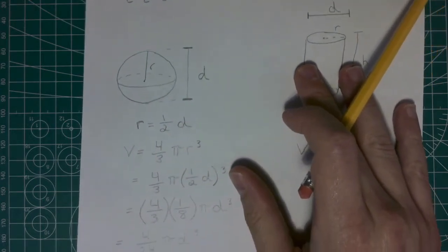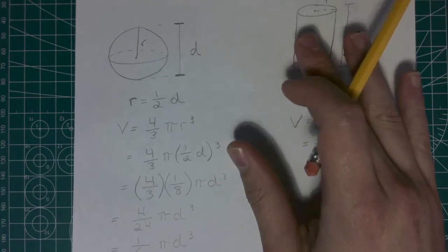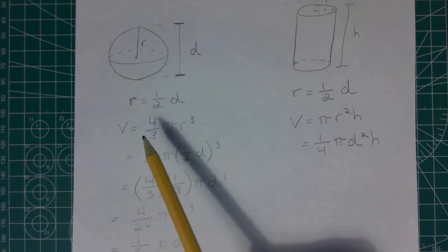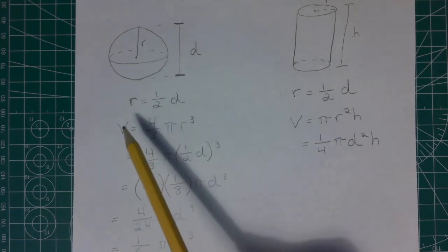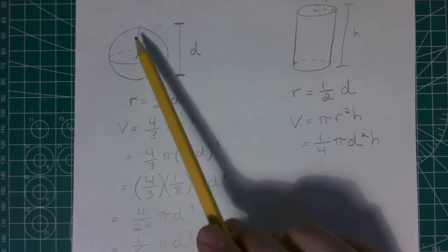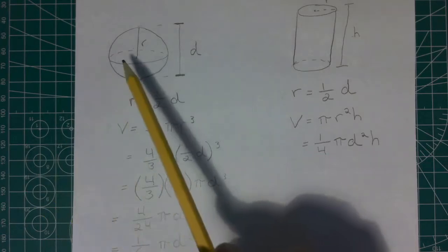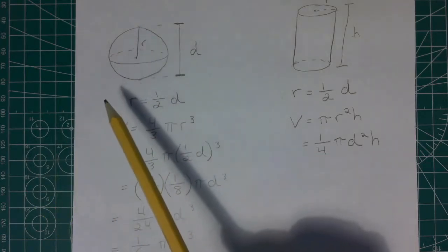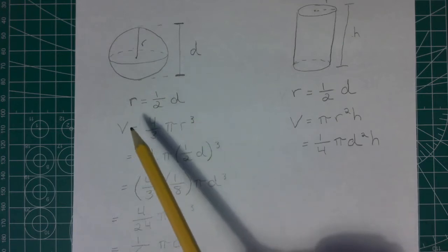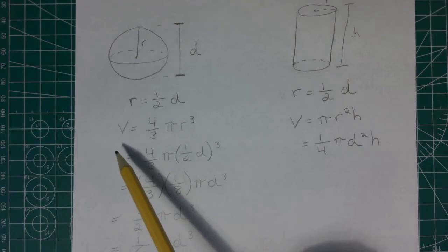Spheres are again a little trickier than the cube or the block. In this case, again, we have a very difficult radius to measure. How are we going to measure to the center of the sphere outward? That wouldn't really be practical. So we're going to get the diameter, the distance all the way across it. The radius in this case is again 1/2 the diameter.